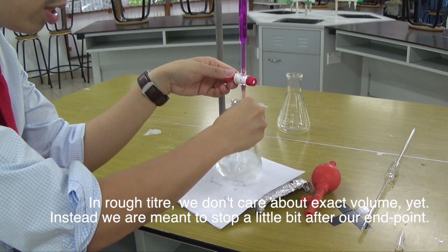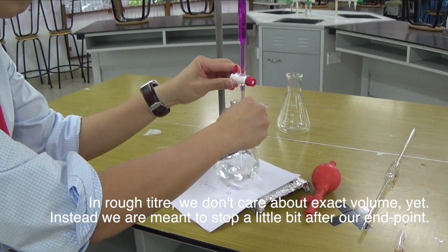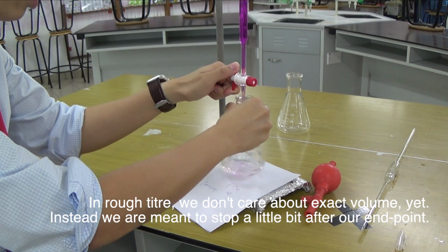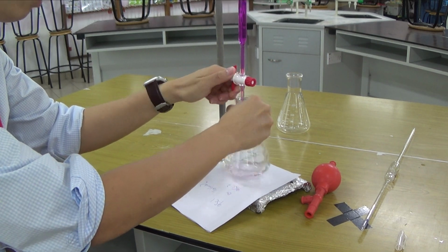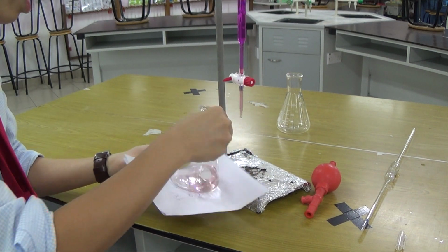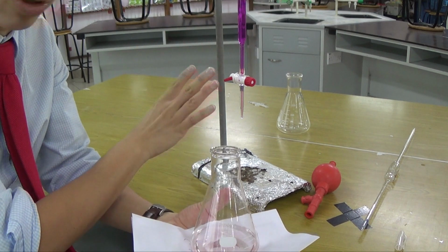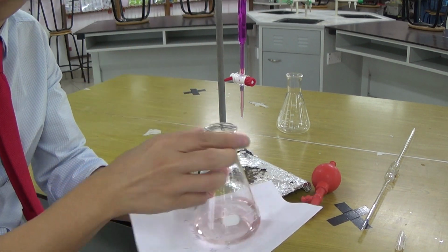So we're just going to continue. You see there's no color change at all, but we're just going to stop when it changes color. Okay, so getting there, I think this is about it. Okay, so this is a rough titration. I wasn't doing it drop by drop because I'm doing a rough titration.